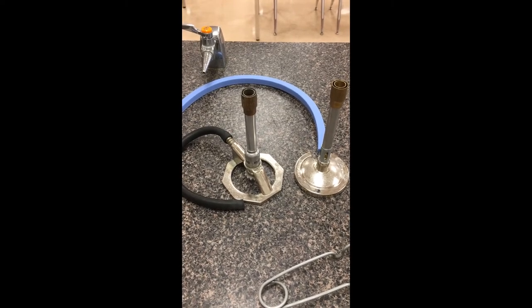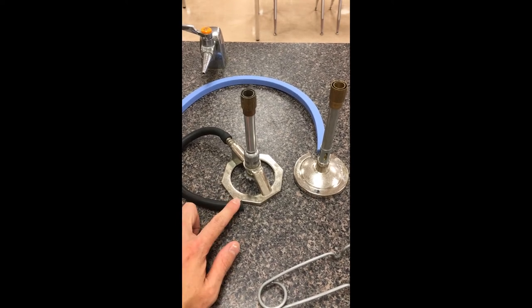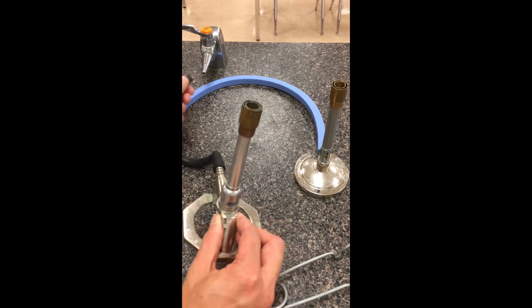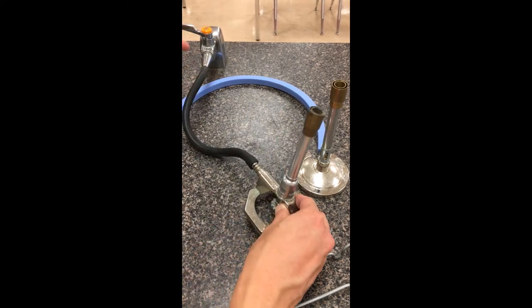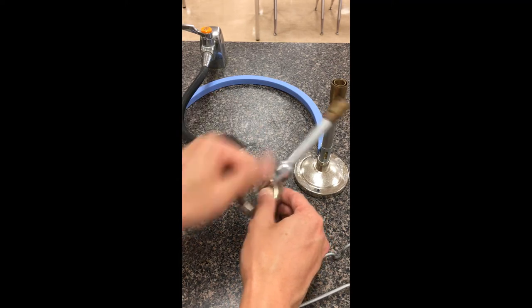Hi everybody. In this tutorial we're going to be looking at using a Bunsen burner safely. We're going to start off with this Bunsen burner on the left. We're going to take this rubber hose and connect it to the gas valve. Basically, gas is going to come along this rubber hose, sideways through and out the top.